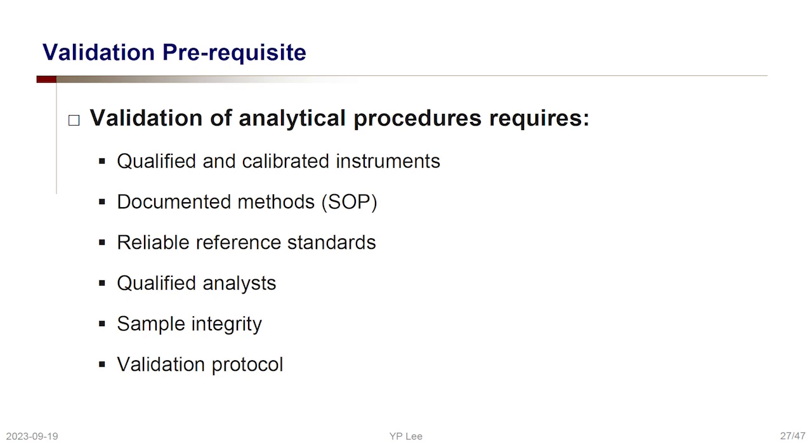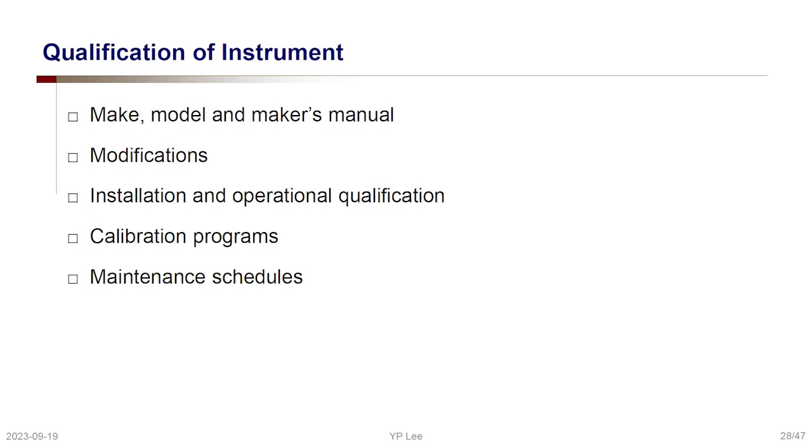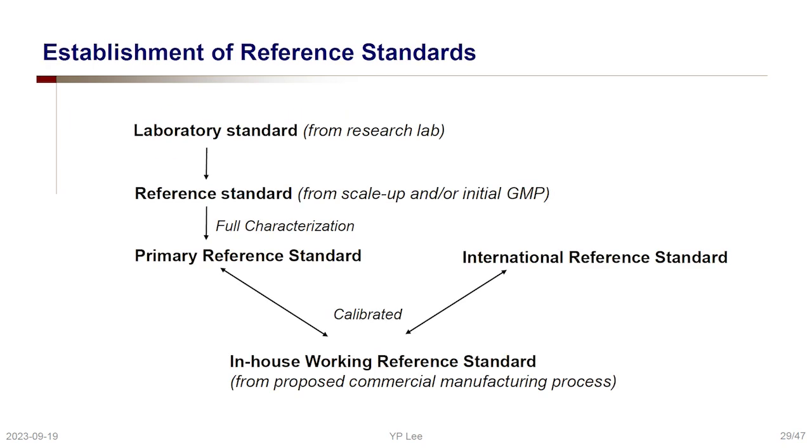In order to conduct the method validation, we do have to have the calibrated and qualified instruments, and we have to have established SOP. And reference standard need to be ready. And of course, the analyst need to be qualified, and the validation protocol need to be prepared. For the qualification of instruments, IQOQ need to be conducted. Maintenance schedule, of course, should be included in the qualification of instrument. And also, the reference standard need to be prepared, as I said.